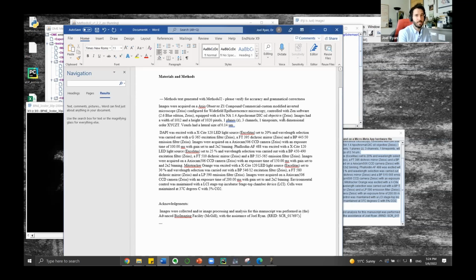So that's most of it. The other output, in addition to, I see the comment here with regards to gain, and yes, I thought I had that solved already, but I will update that. There is a mistake here with regards to the gain. Since I didn't put any gain, we have that little bit of text. I thought I had solved that already, to remove it when there was no gain, but we can go in and fix that, and it is also customizable in that sense. So yeah.